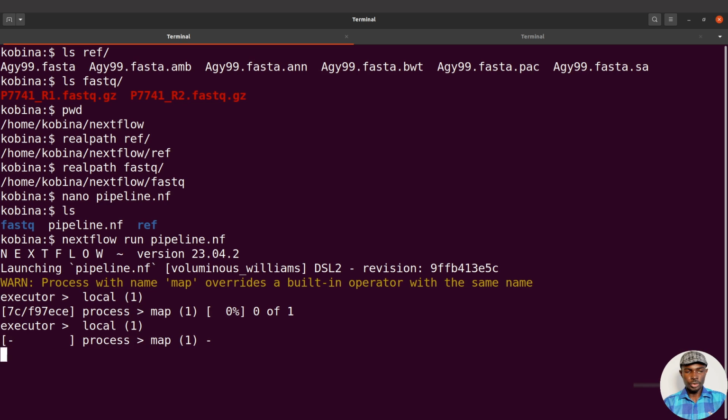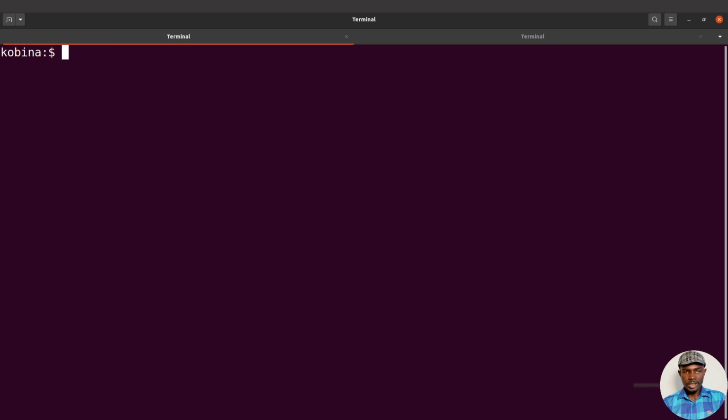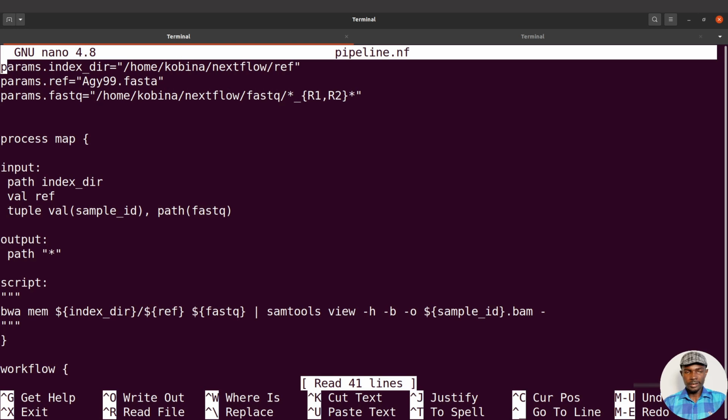So I'll just use Ctrl C to cancel like this. I'll clear the screen and then I'll do a nano again. Let me just do it here again. So nano pipeline.nf. And then when I come here, I'm going to change the name.